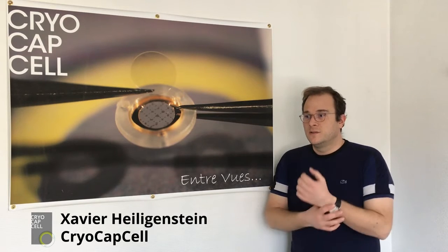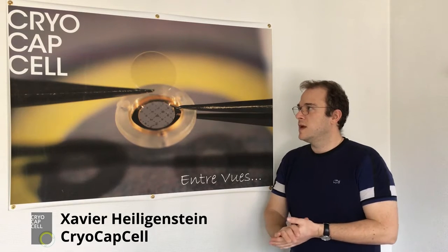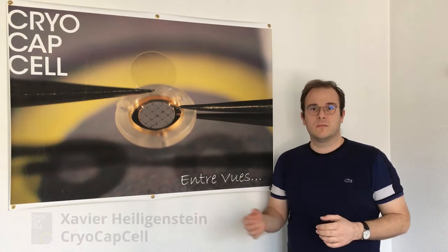What is the concept behind cryo-capsule? The company was initially created to address questions regarding correlative light and electron microscopy.